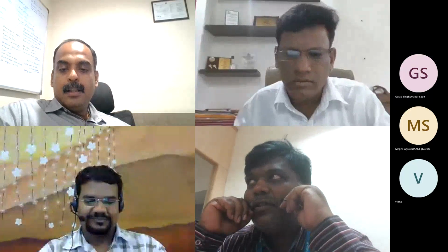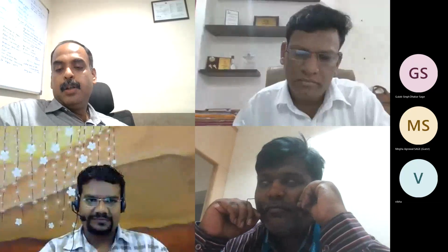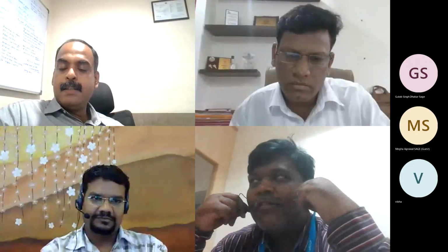Yes. Okay. That happens. In the initial interfacing, you will have a little challenge to get it sorted out. But if the same analyzers are there, it can be done quickly. If it's a new machine, you will have to get the team from the modality, because the modality people who come for installation may not be informatics experts. They will be experts in that machine, but for the interface and informatics, they have a separate team.